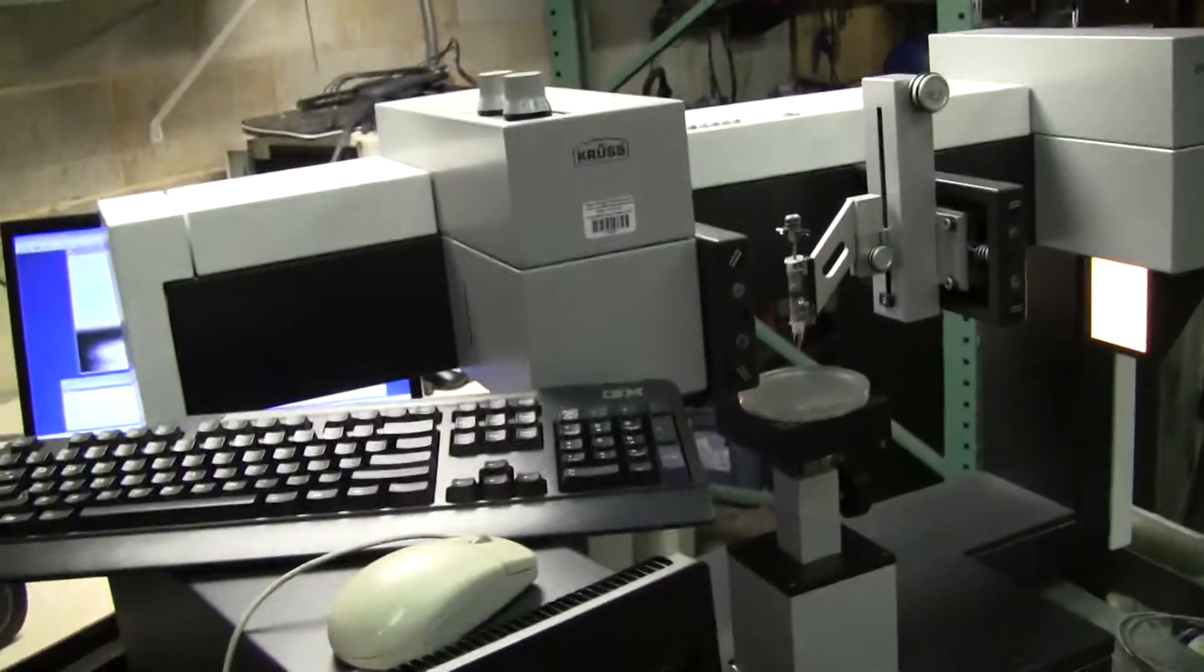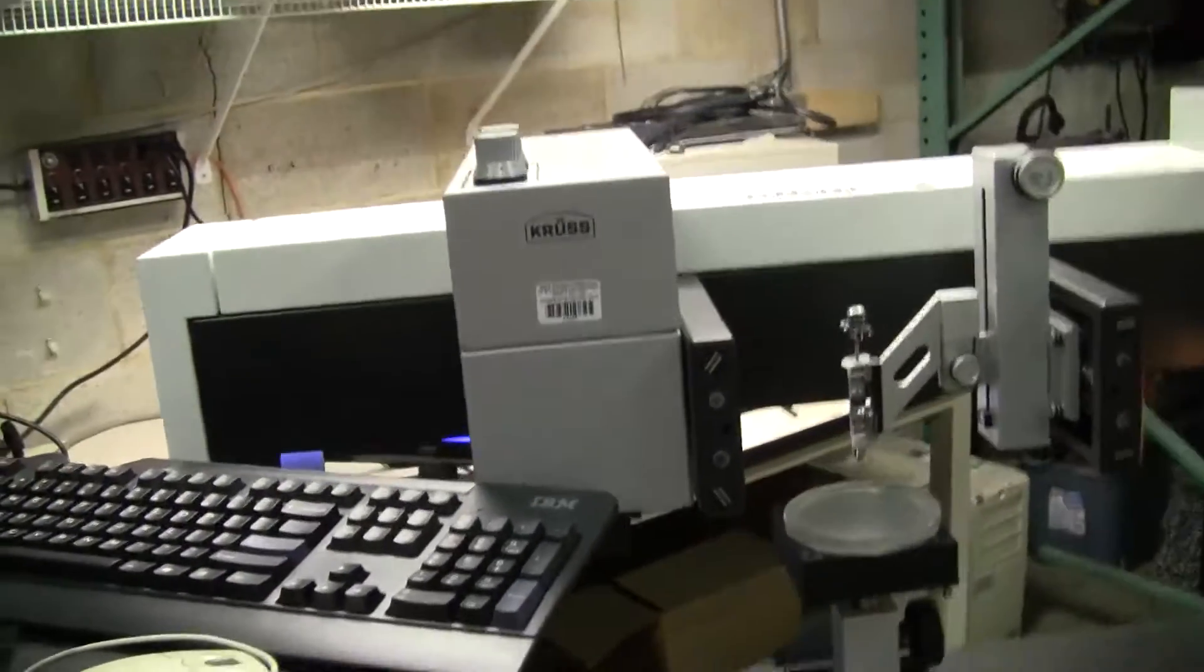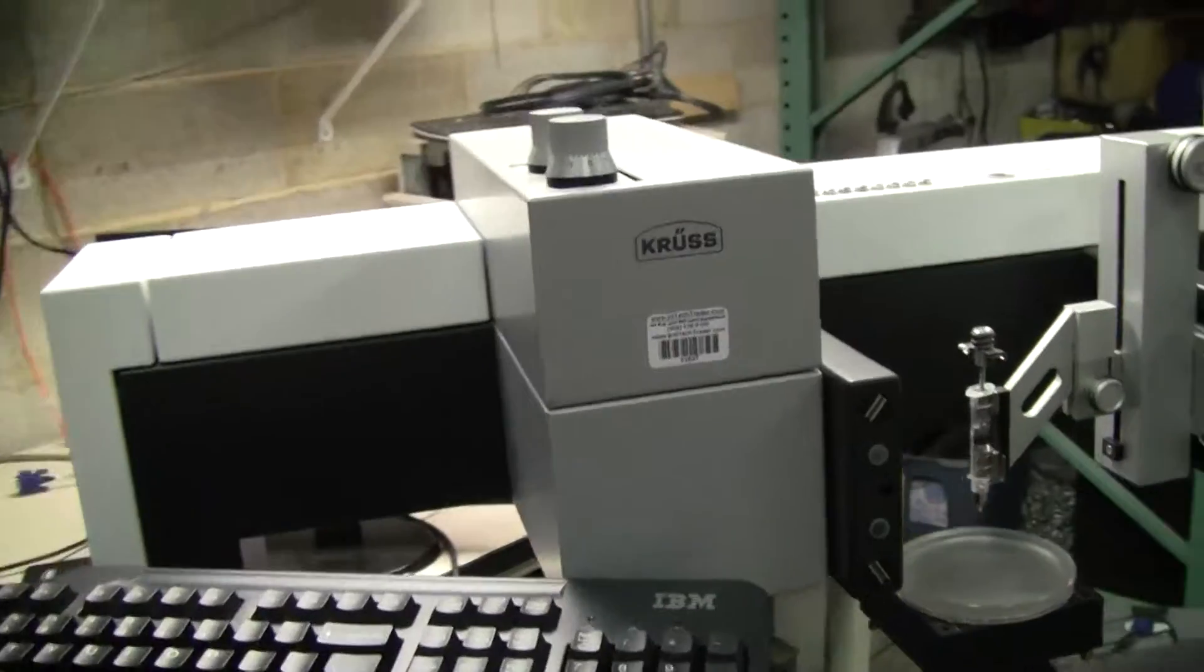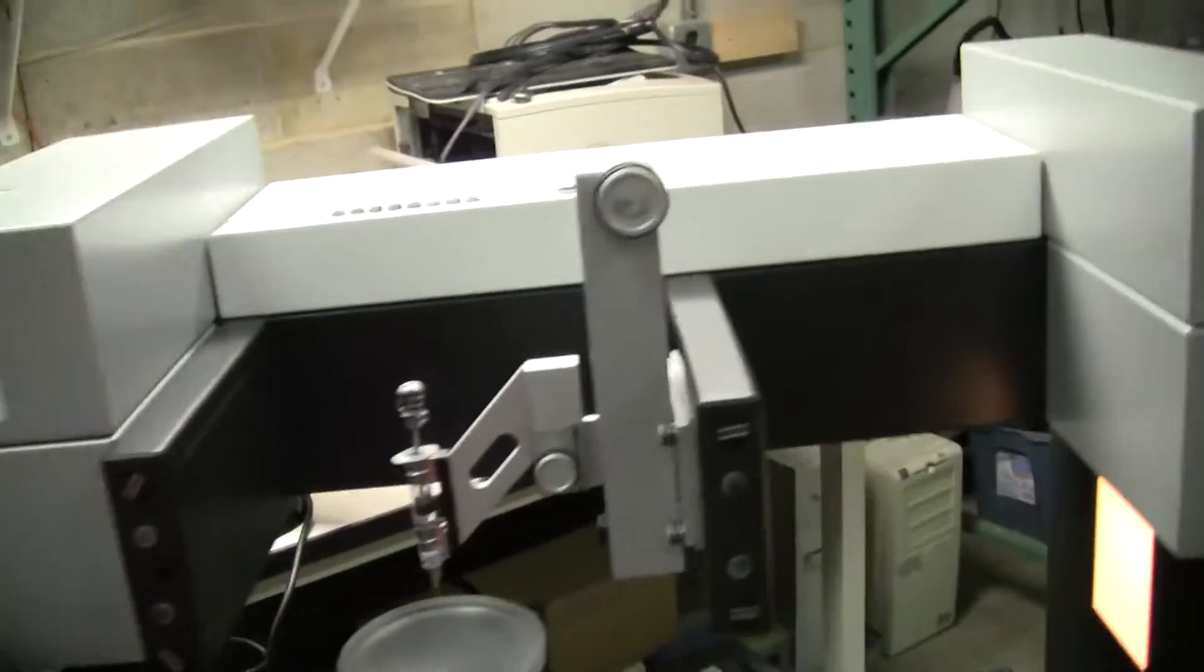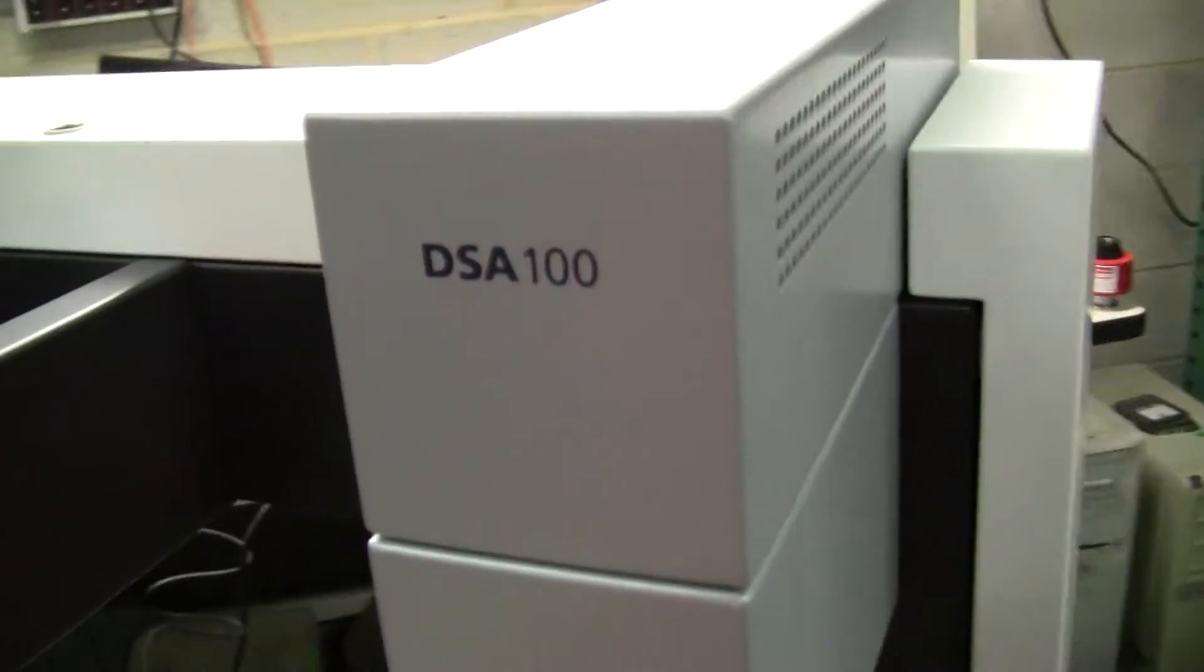Hi this is Michael Natal from Hitech Trader once again demonstrating another fantastic instrument. This is the CRUSS DSA 100.